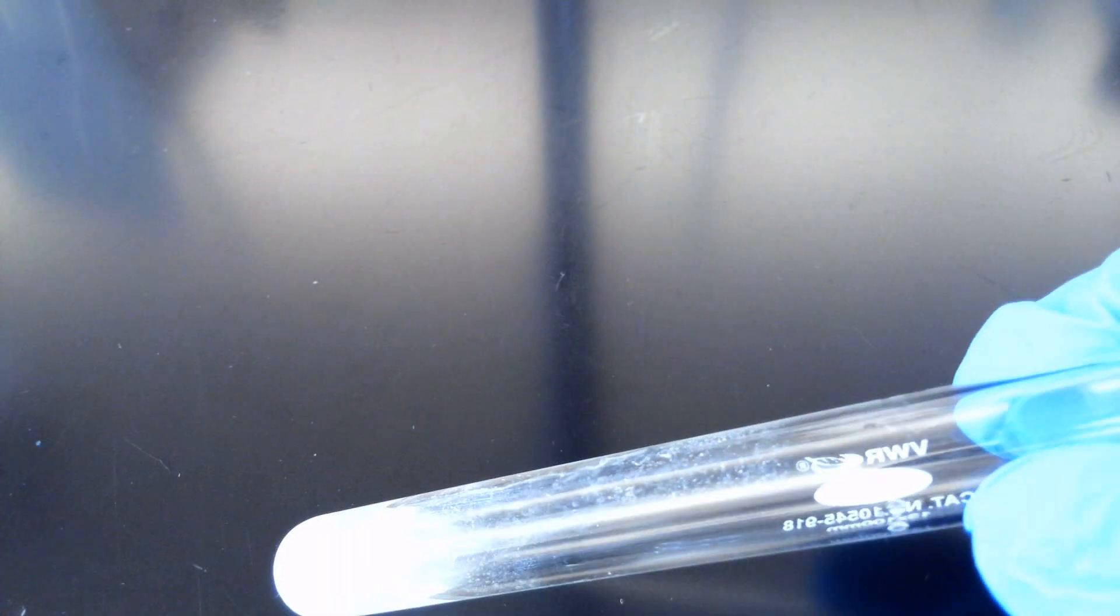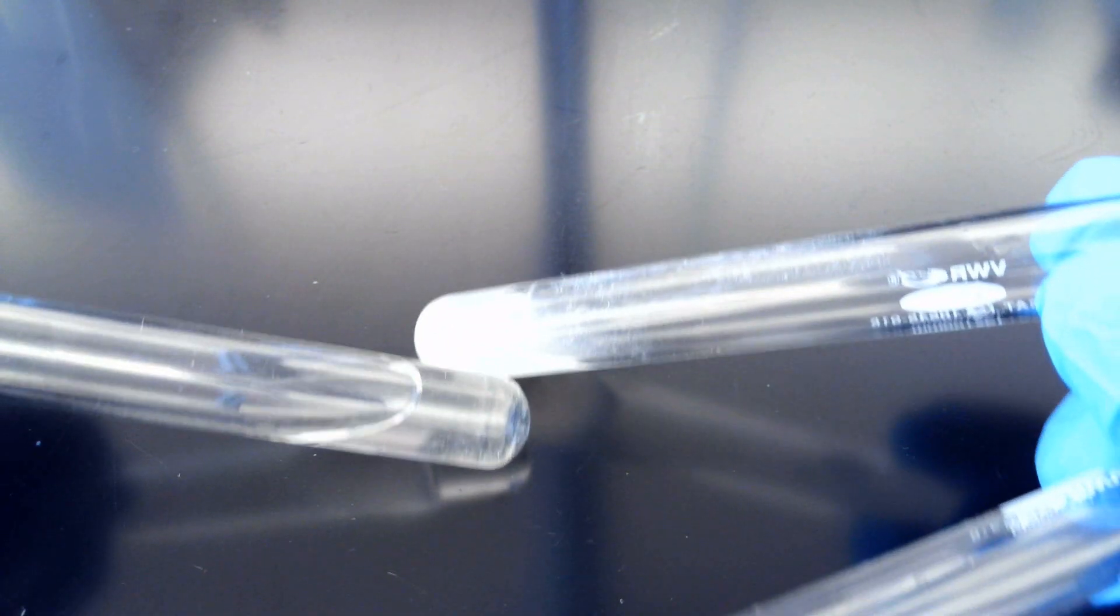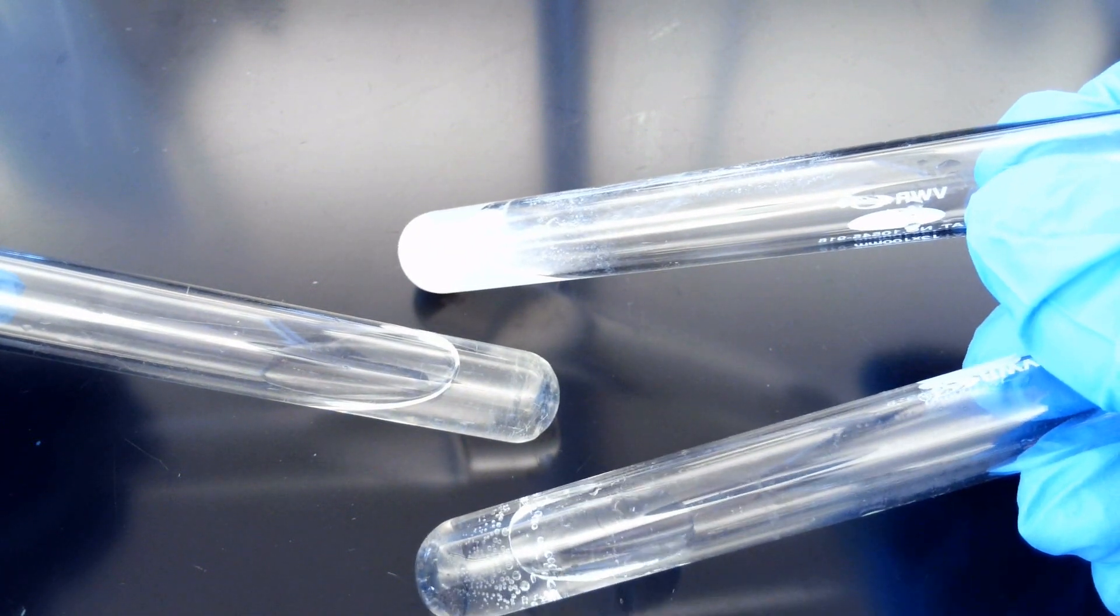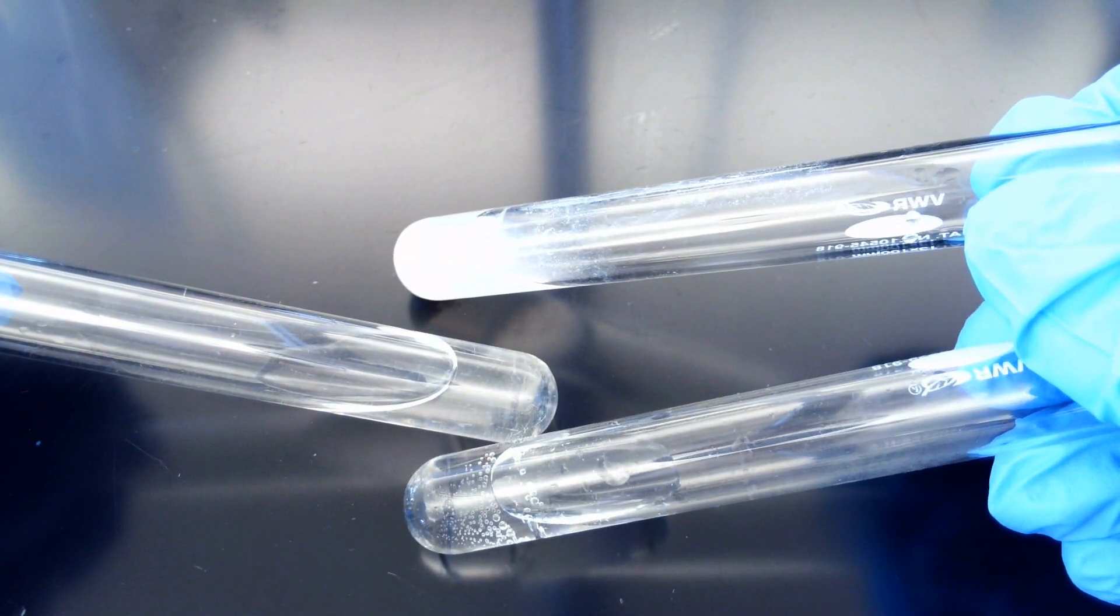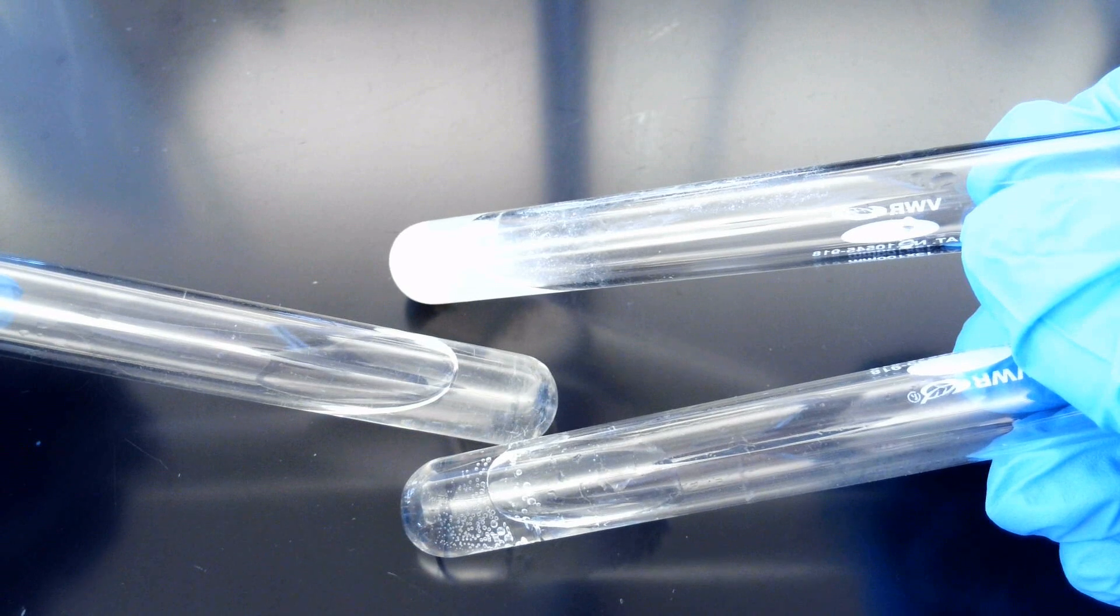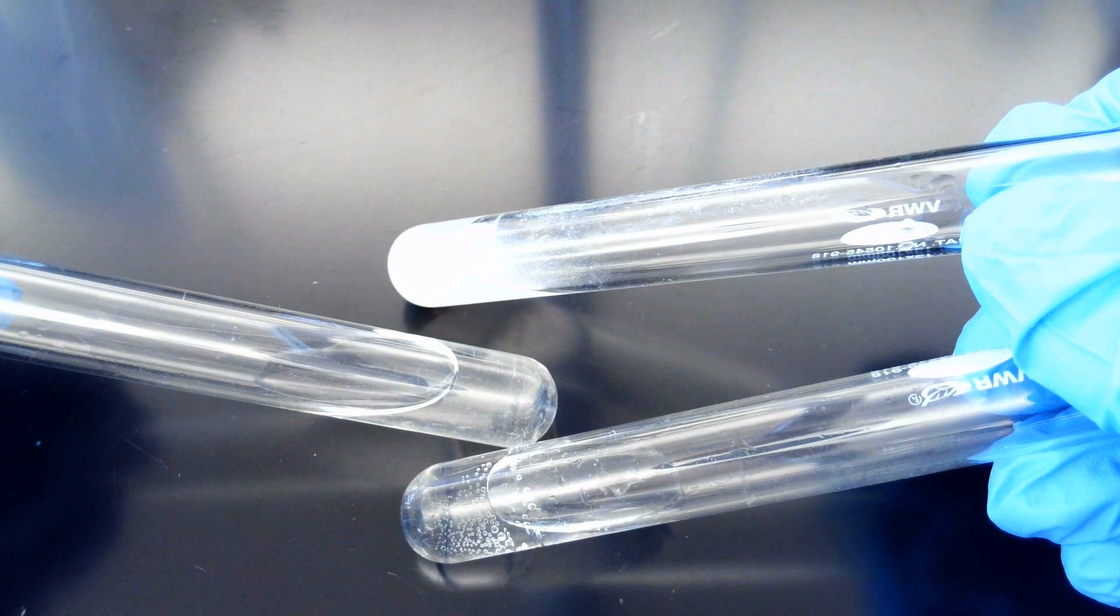With NaOH, we were negative with no reaction. And with HCl, we had all those bubbles. So that would be our unknown in review. Thank you.